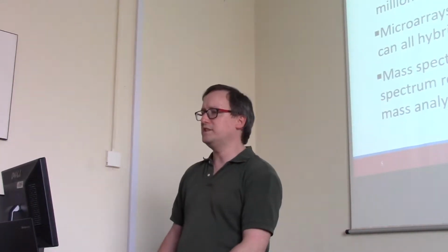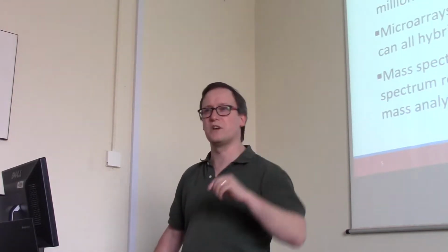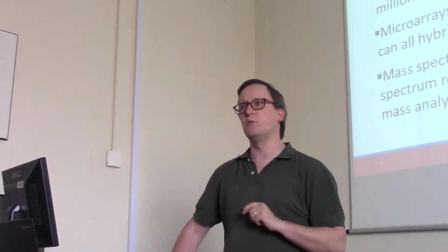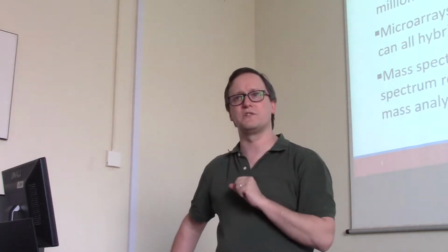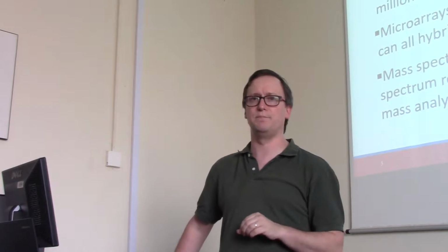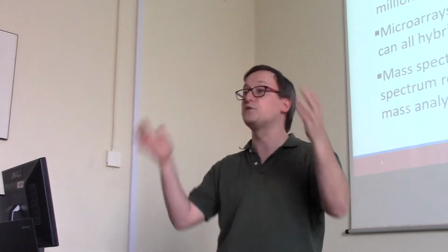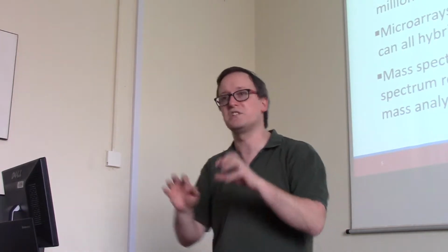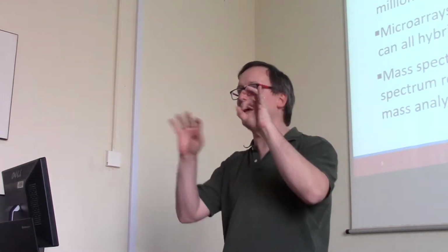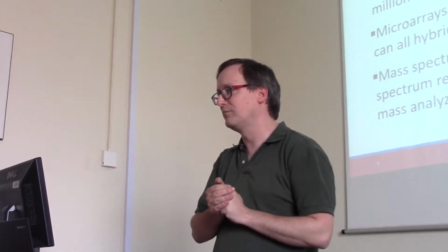So I want to change us also in how we're thinking about what measurements go into this. Frequently when you're working with microarrays or you're working with a sequencer, you are measuring lots and lots of different molecules all at the same time. We saw our little video of the flow cell for an Illumina sequencer, and we saw that each of these little patches of light represented a different sequence that was building out base by base.